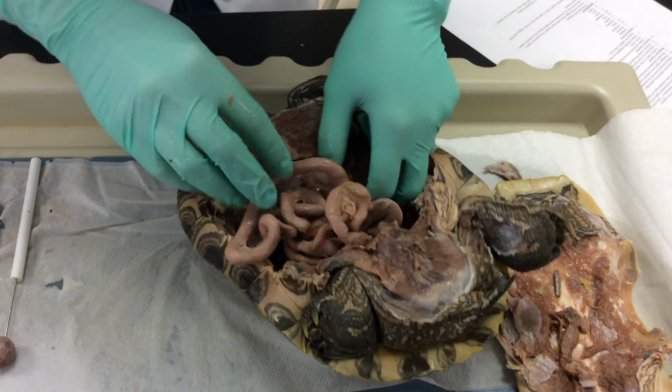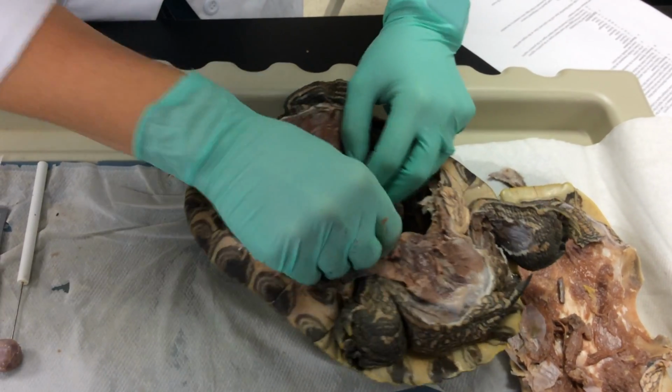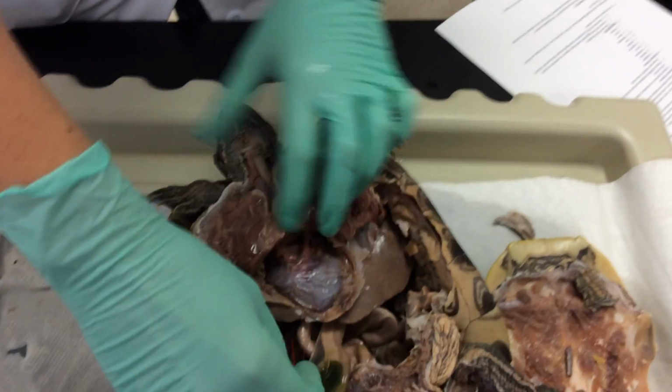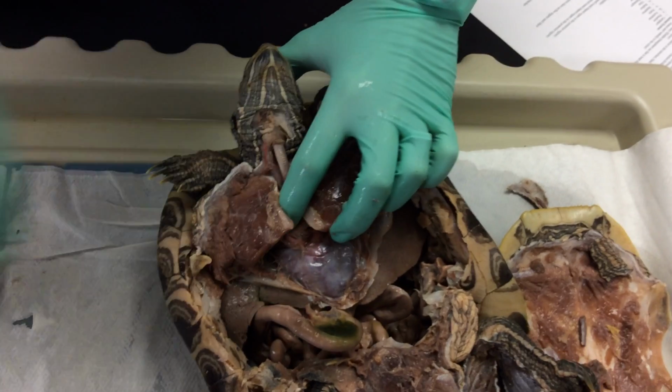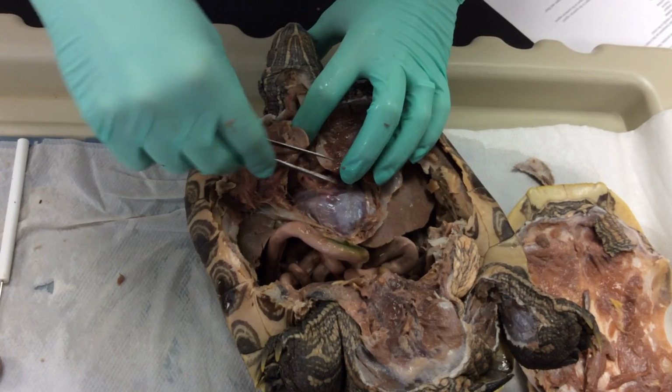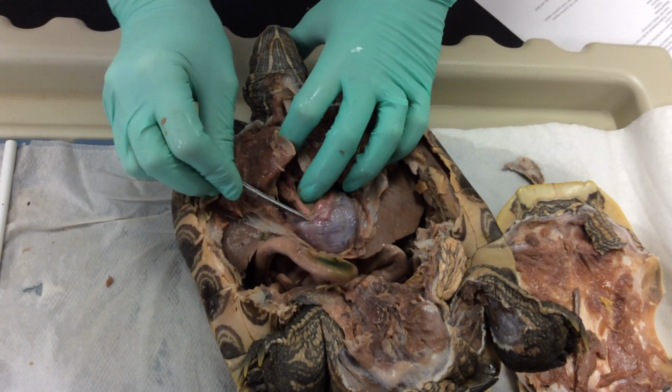Okay. Now we're going to go into the circulatory system. So if we're looking at the circulatory system, we have the heart, and that's this right here, this structure. And it's currently covered by a pericardial sac. And so the pericardial sac, we're going to open it up and look at the different parts to the heart inside.